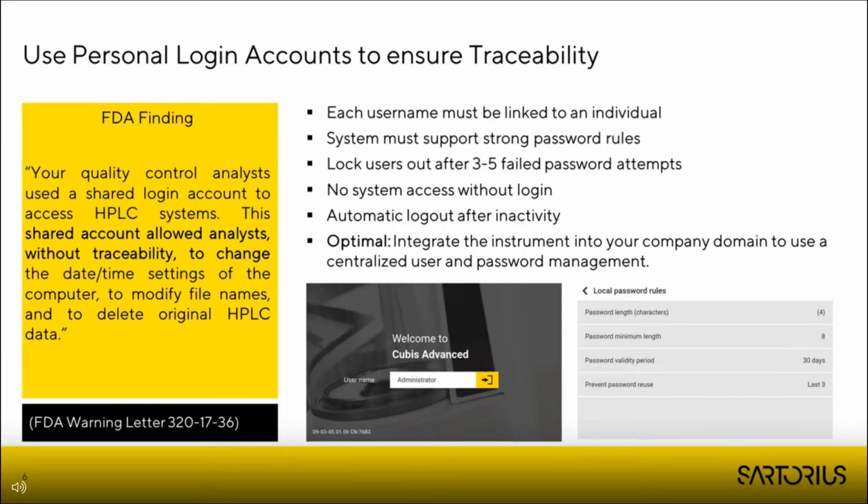Yeah, our next FDA finding is quite a common one. Here it is possible that a user logs in via a shared account, for example, operator or administrator, into a system and can create data or change system settings without traceability. And therefore, you should make sure that the computerized system can only be used with a personalized user account, so that you can see exactly who made changes in the system or who generated data on the system.